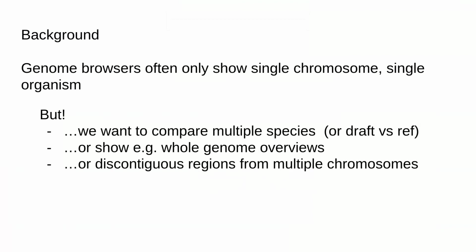So to solve some of these problems, we developed JBrowse 2, and I'm just going to show how JBrowse 2 can be used to explore some different types of structural variants.